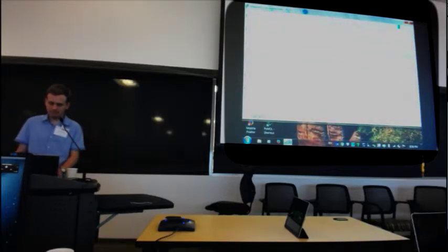Yeah, the problem is, again, the console was occupied. The file name is submit.cfg. So change the base file path to your username, CASS tutorial CASS.